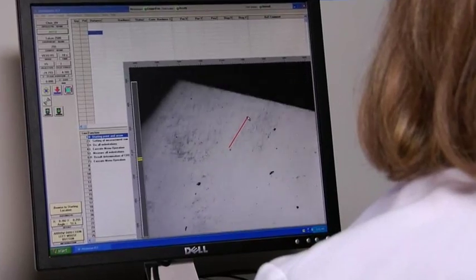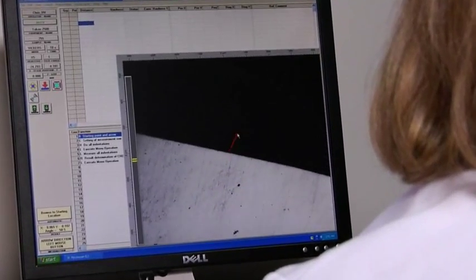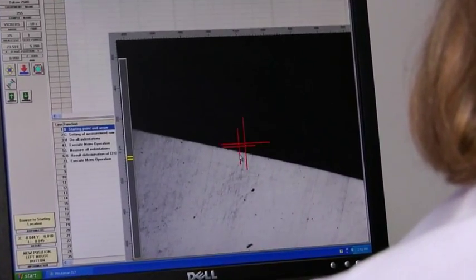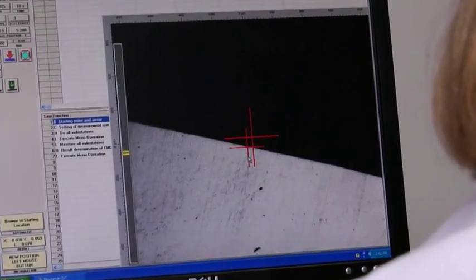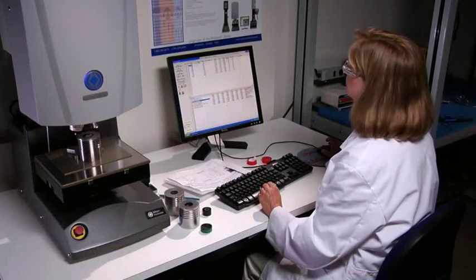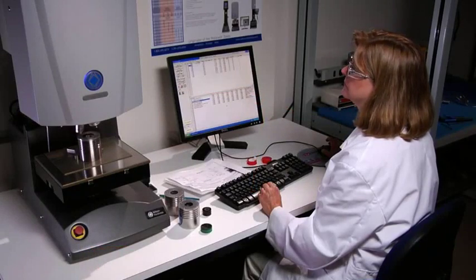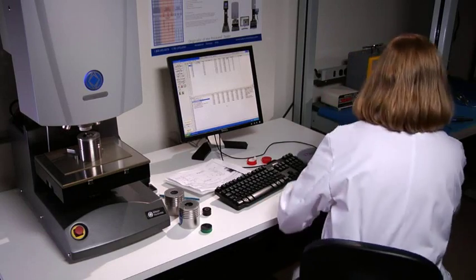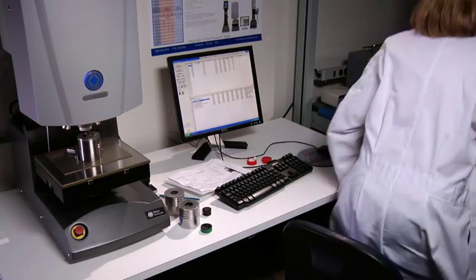A virtual joystick easily positions your sample and defines your starting point and traverse direction. The automated testing sequence begins with a simple click, and the operator is now free to work on other tasks.